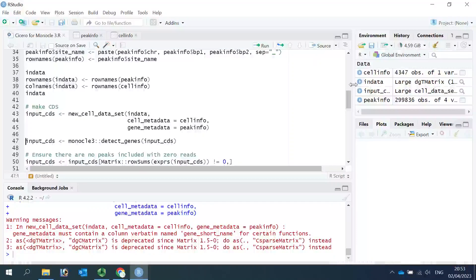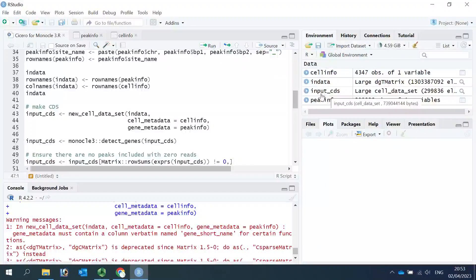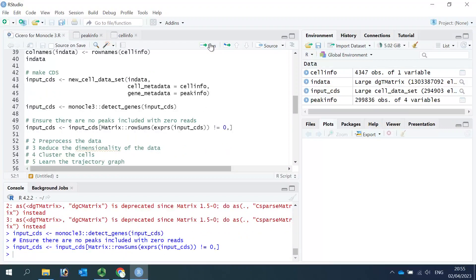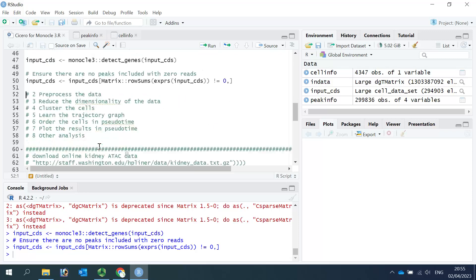You can see in the data window we have a CDS object named 'input_CDS' — it is a large cell dataset. Now we can use the detect_genes function in the Monocle3 package to detect all genes that have expression above the threshold, and make sure there are no peaks with zero reads included in the CDS object. The data is now ready for preprocessing, dimension reduction, and cell clustering — after that, we can perform the trajectory analysis.